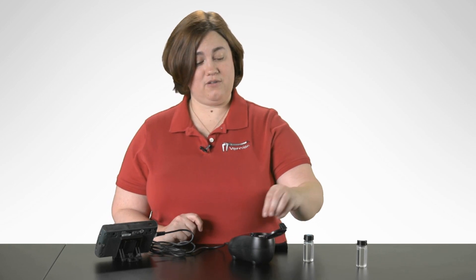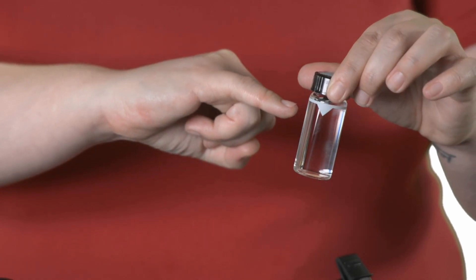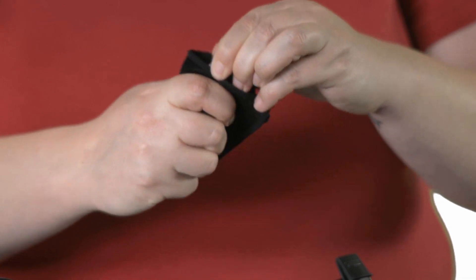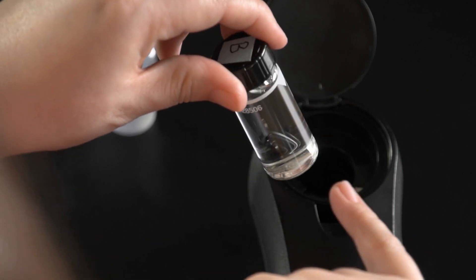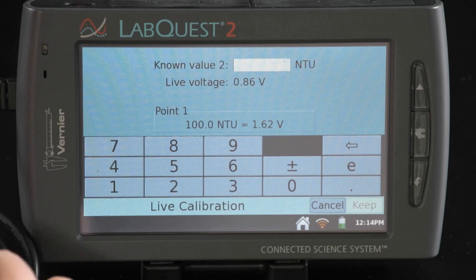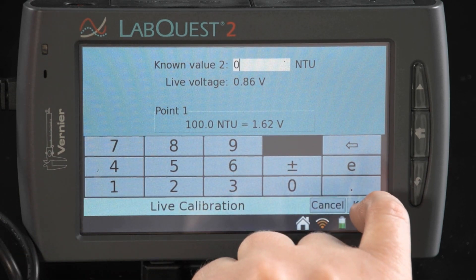My second known value is going to be zero, which is with my distilled water. I've taken the empty vial that comes with the sensor and filled it just above the line so the meniscus is touching the top of the white line on the bottle. I wipe off the vial to remove any fingerprints, then place the vial into the turbidity sensor again, lining up the arrow on the vial to the arrow inside the sensor. I close the lid, wait for my voltage to stabilize, select zero as my known value, and then keep.